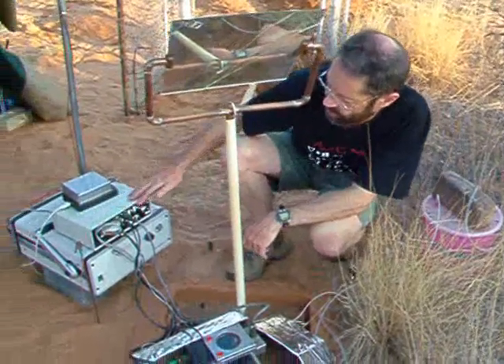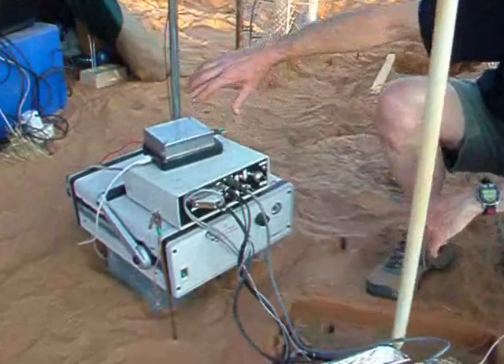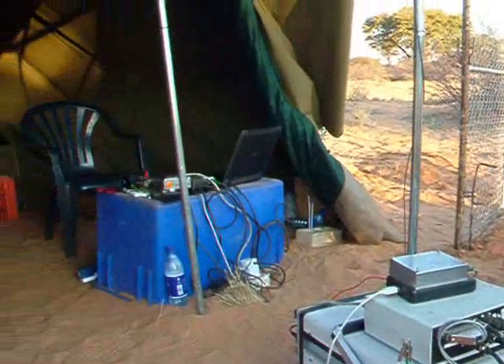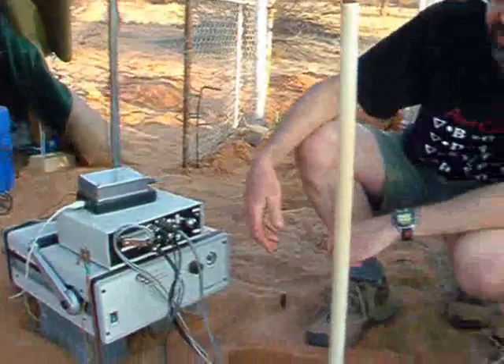We've got the control box for the electronics, and then an interface which runs out to the computer, which logs all of the data that we're taking, controls the cycling of the valves, and monitors temperature, relative humidity, light levels, and so on and so forth.